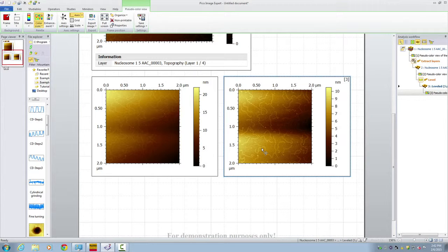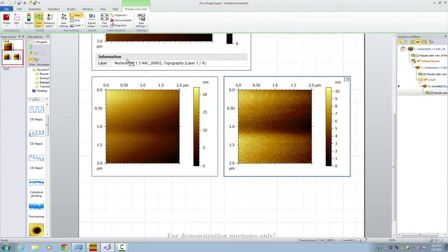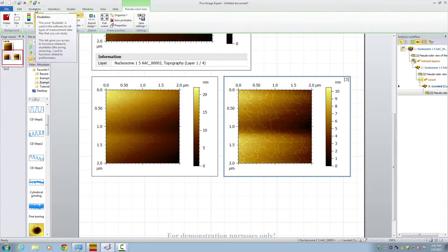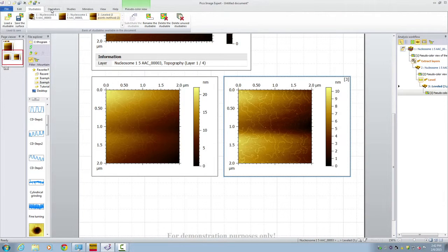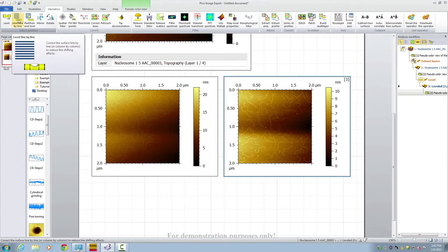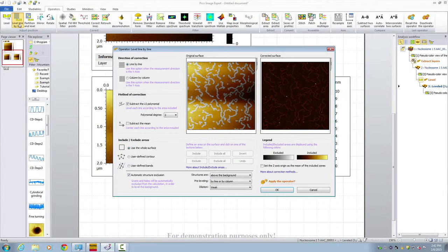Now notice they still have line by line shifts in this image. So we're going to go to the next level of flattening. We call it a line flattening. Again click on the image. Go to the study ball, go to operators, and level line by line. Click that. It opens a page here.